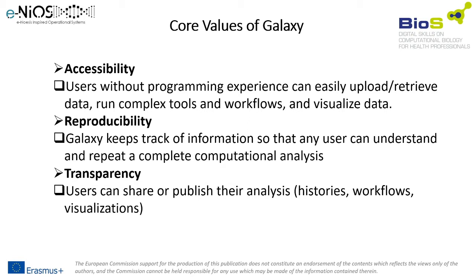But what are the core values of Galaxy? Why use Galaxy? Because it provides accessible, reproducible, and transparent research. Data analysis can be very complex, and it often requires specialized programming knowledge or command line skills. But Galaxy makes this a lot easier by providing a graphical user interface to popular data analysis tools. Galaxy is also a web-based platform. This means you don't have to install anything, just open your browser and navigate to Galaxy.